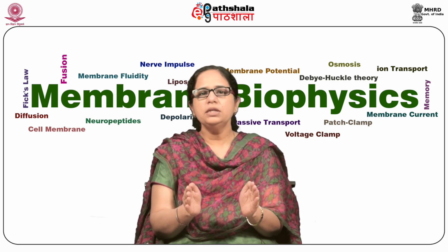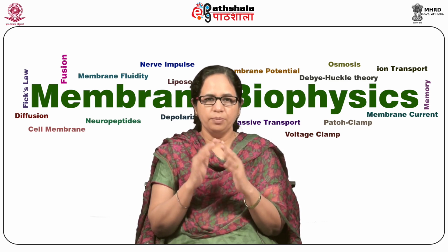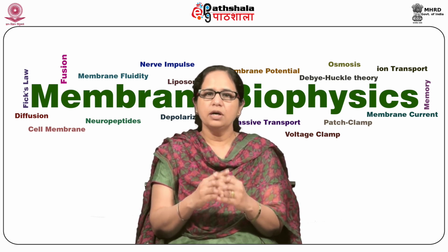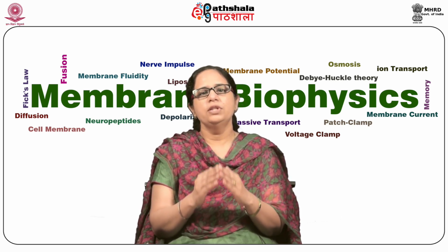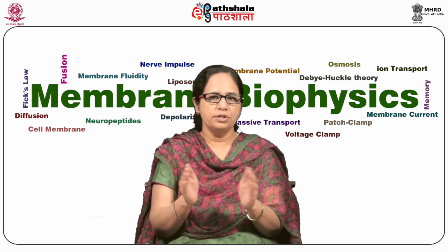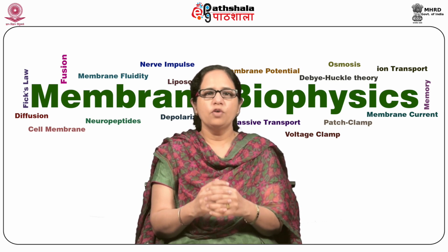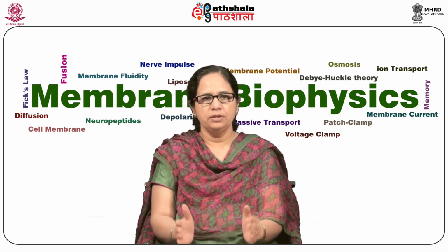Secondly, it is much easier to gain information about channel behavior using currents measured from an area of membrane with a uniform controlled voltage, than when the voltage is changing freely with time and between different regions of the membrane. This is particularly so as the opening and closing of most ion channels is affected by the cell membrane potential.